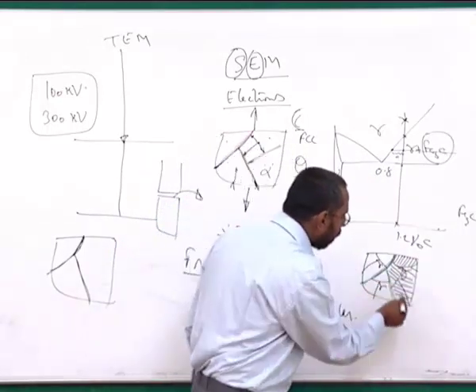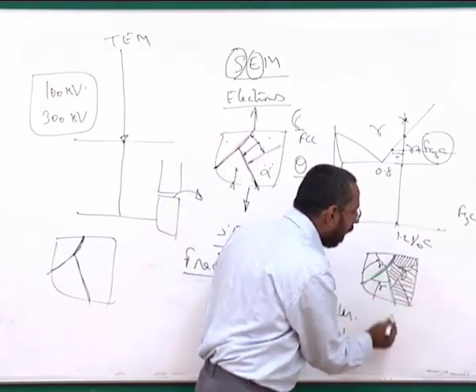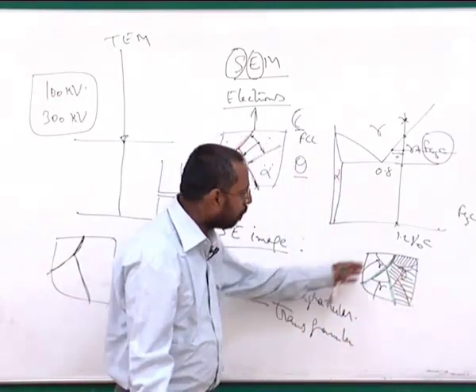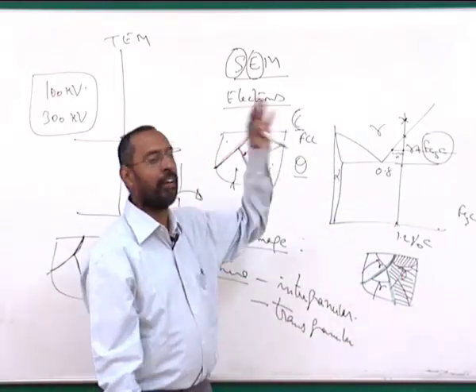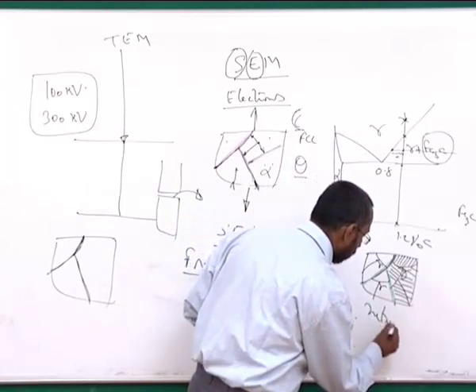So these are all pearlite, whereas what you see clearly is cementite at the grain boundaries, what we call a continuous network of cementite.